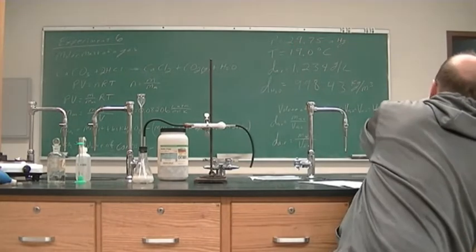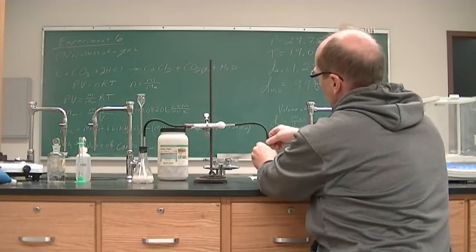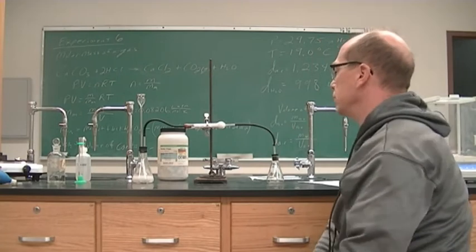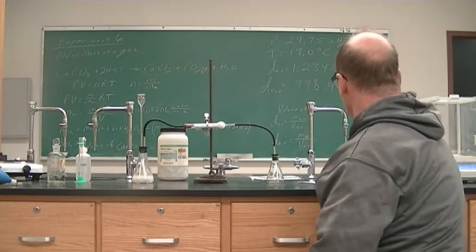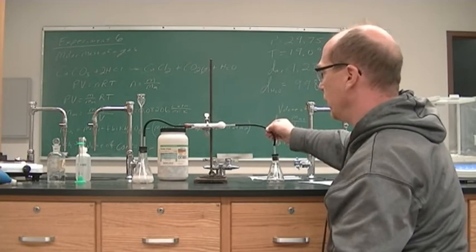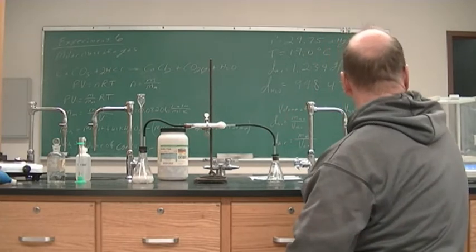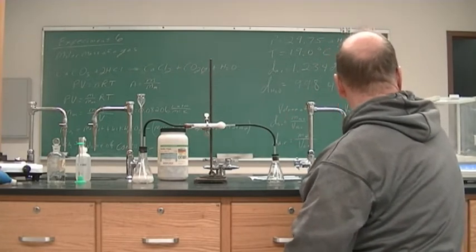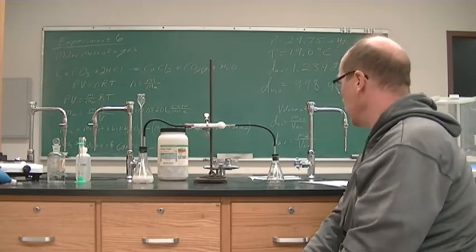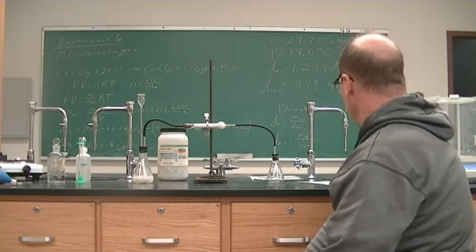All right, so we will continue adding the CO2. Pinch it again. Yep, it's going up. Not going up as fast as it was before, but it's still going up at a good rate. Our balance is now calibrating itself, so I'm going to let this go longer than I normally would for the balance to finish doing its calibration.